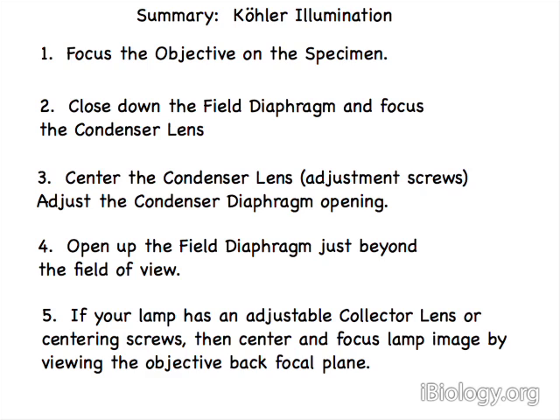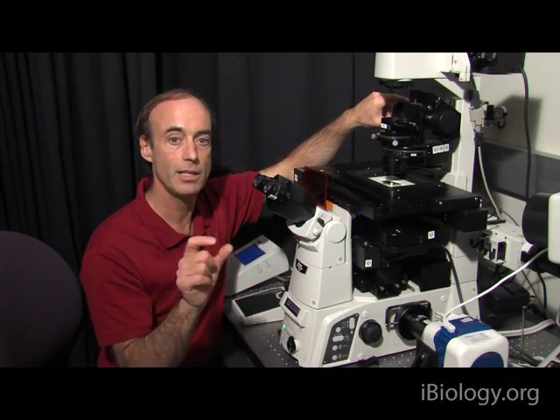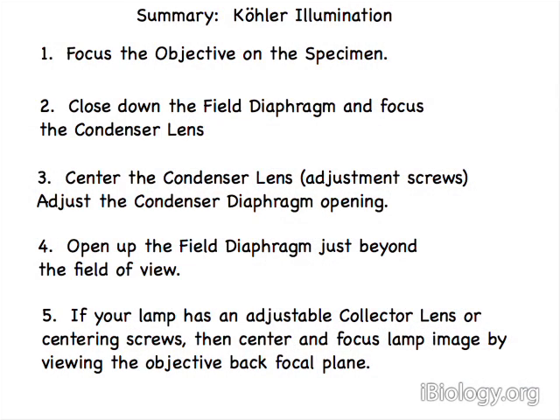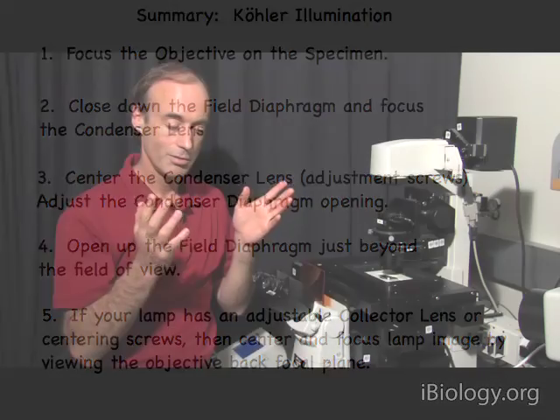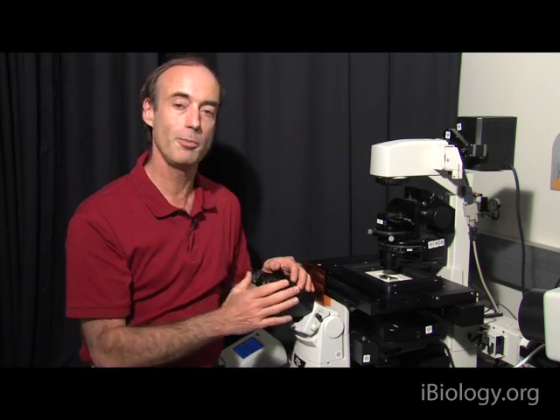In summary, let's go through the steps again. First, we put the sample in place, adjusted the light intensity, and focused on the specimen. Next, we closed down the field diaphragm and adjusted the position of the condenser lens, looking through the eyepiece until we see the iris of the field diaphragm clearly in focus on the specimen plane. The third step is to open up the field diaphragm just past the field of view. Finally, we adjusted the condenser aperture. The key thing now is not just to watch the lecture, but to go find a microscope yourself and go through all of these steps in Köhler illumination and practice them so it becomes second nature.